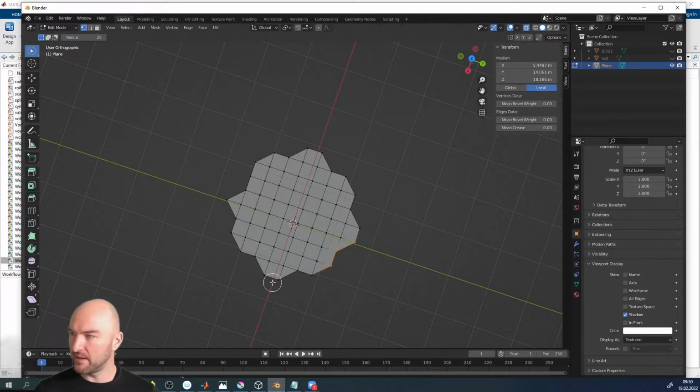So who's made it that far? Is everyone on the same page as me? Does everyone have a grain boundary? Okay, I see some green, not just green from Erlangen. That's good.